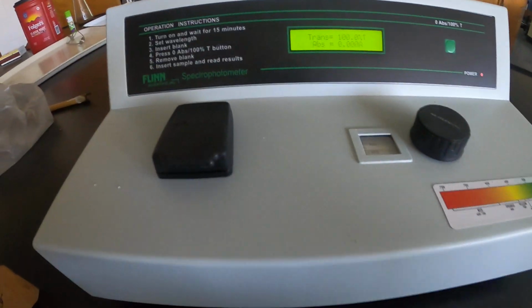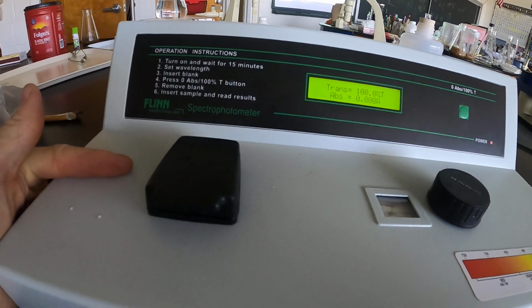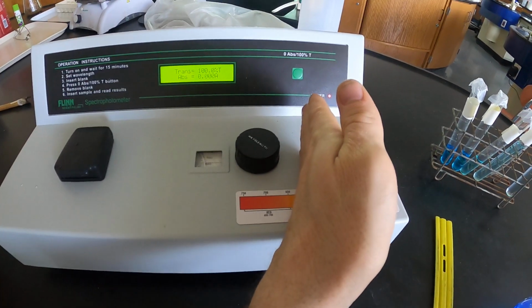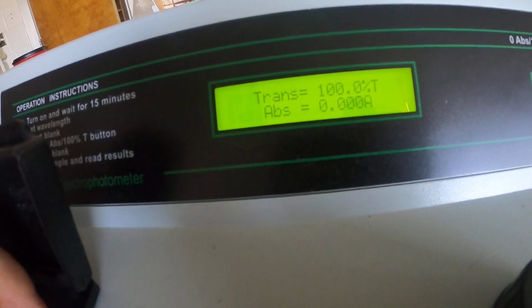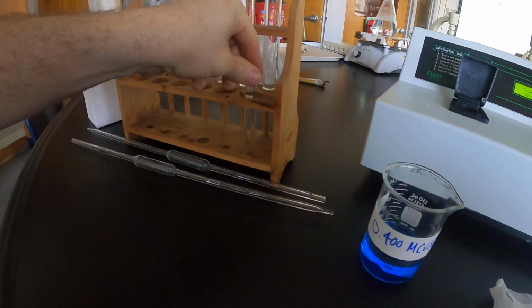So the concept is there's a light source coming from over here. It's shining a particular type of photon through the material, specifically at 680 nanometers, and then there's a detector over here picking up how many of those photons actually make their way through the solution, right? And we've set the instrument to read 100% T, like I just said, because all light is transmitted in the sample, all right? So you can place your cuvette over here.